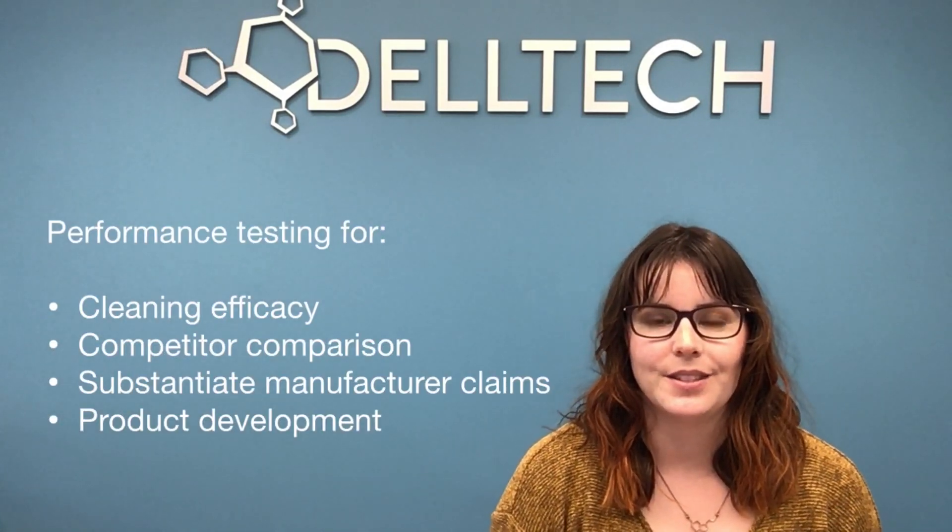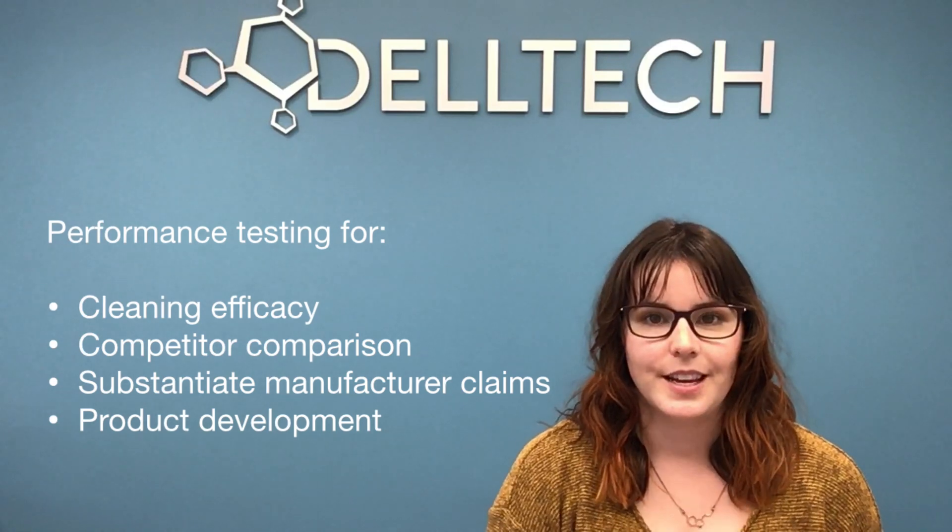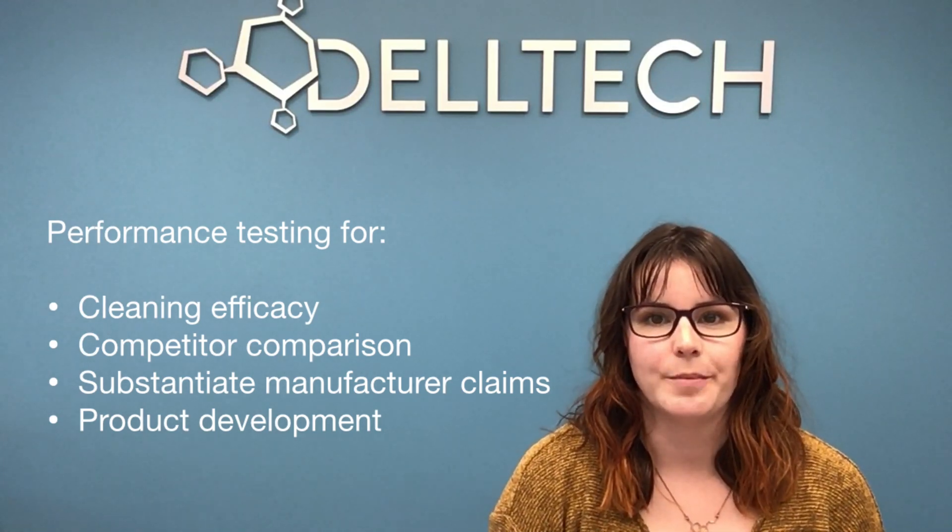Hi, I'm Katherine Hatherly, a lab technician here at Dell Tech. Generally speaking, performance testing is used to determine how well a cleaning product works, either on its own or compared to the competition.